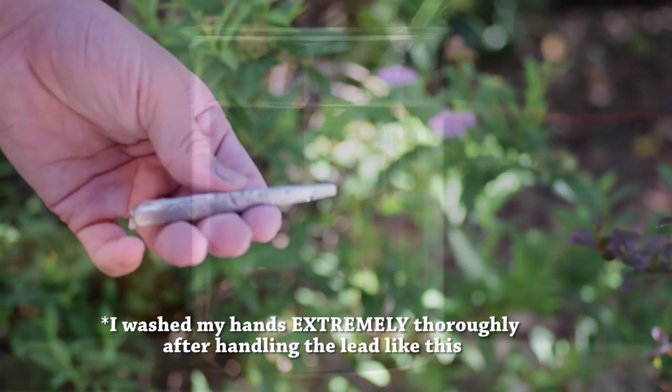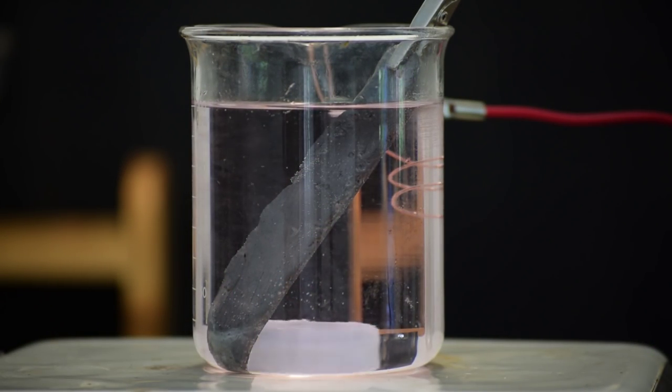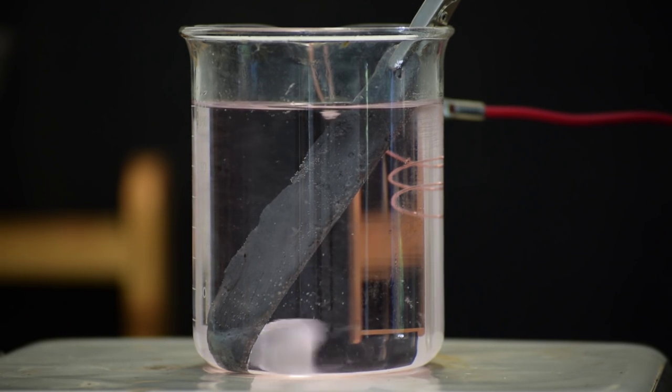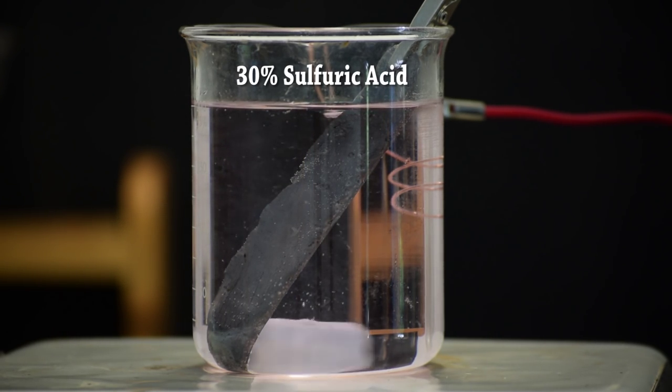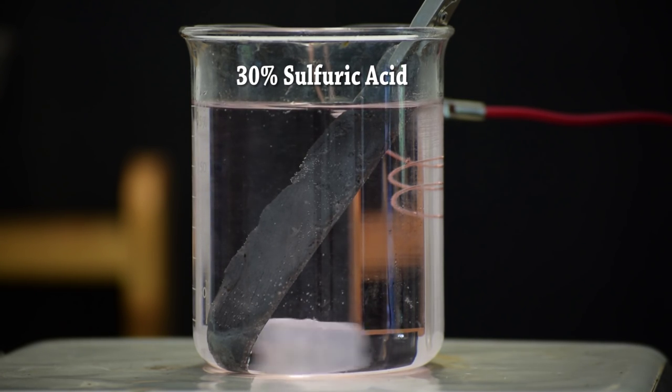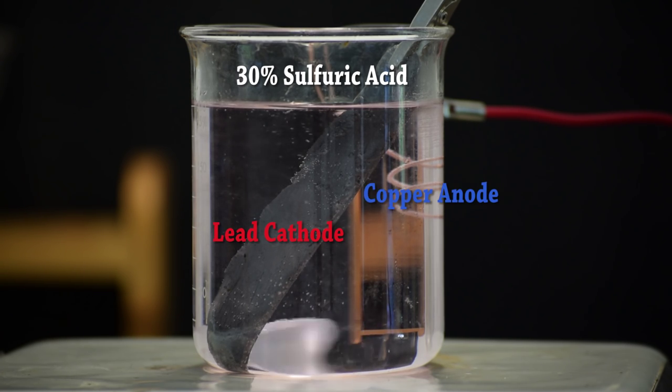Now it's time to electrolytically coat it with lead dioxide. The setup here is relatively easy to make. The liquid is 30% sulfuric acid and is being stirred by a magnetic stir bar. This will keep the sulfuric acid solution moving and it will provide a better lead dioxide coating in the end. The lead bar that I made earlier is hooked to the positive output of a DC power supply, and a copper wire is hooked to the negative output.